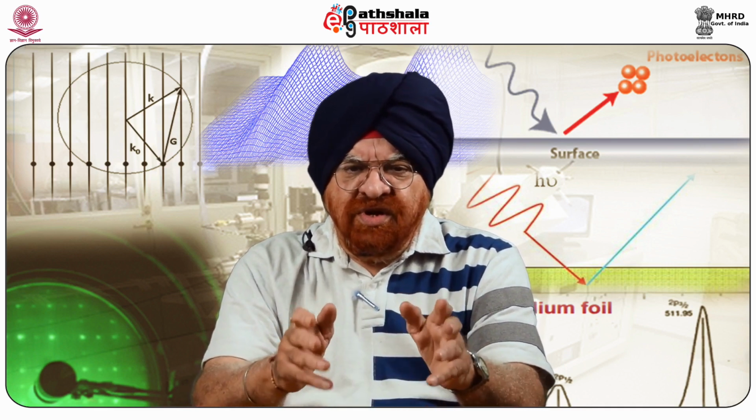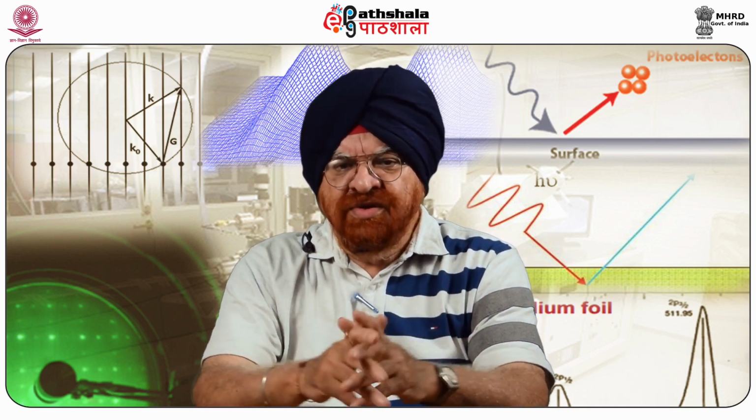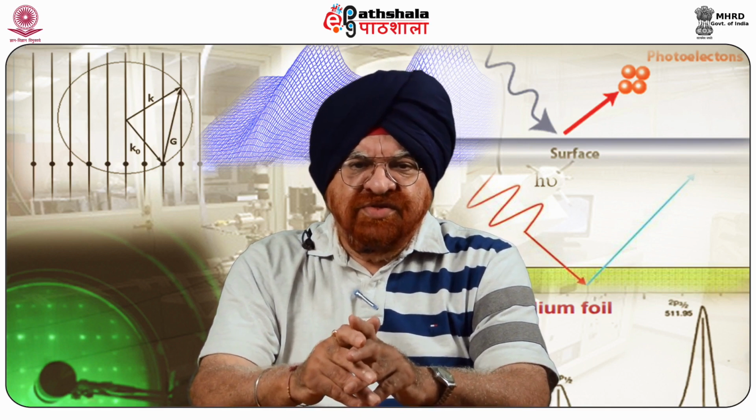The spectrometer is in general a computer simulated design that optimizes the resolution while keeping an acceptable electron flux, which is automatically done. The energy for this excitation is taken away from the electron's kinetic energy. Then the energy of the scattered electron E_As is measured and the energy loss can be calculated.